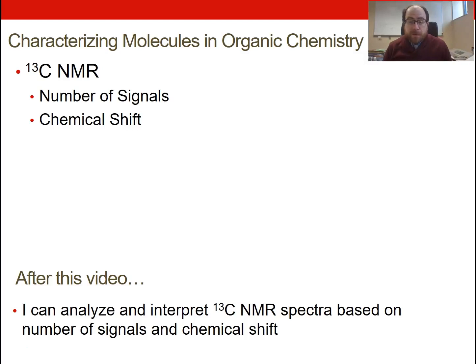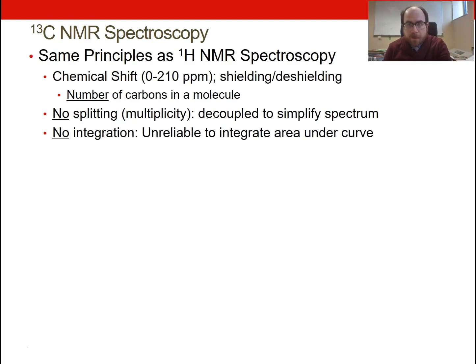Hello everyone. In this video we will begin our discussion of carbon NMR. So we'll cover the basics, which is identifying the number of signals and talking very briefly about the chemical shift, and then we'll conclude this video with a short demonstration on how we would apply this towards the characterization of a particular organic compound.